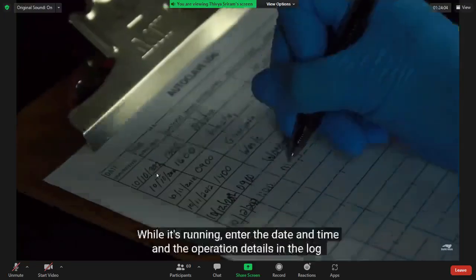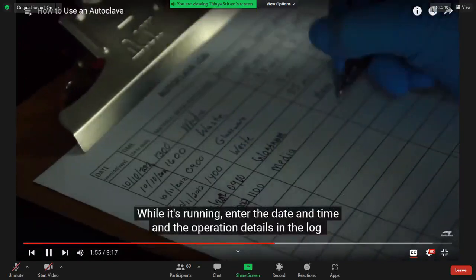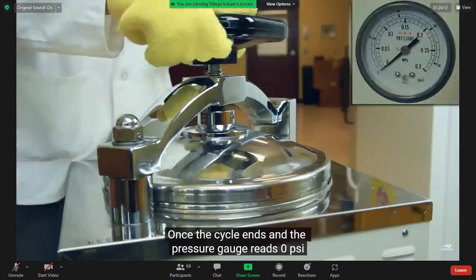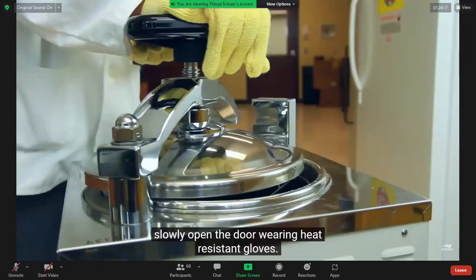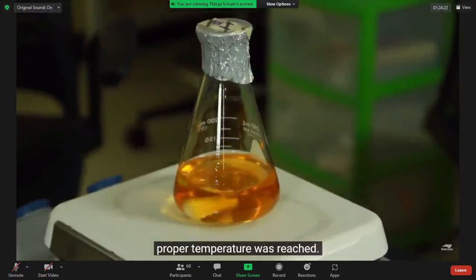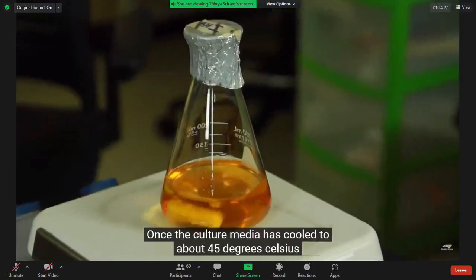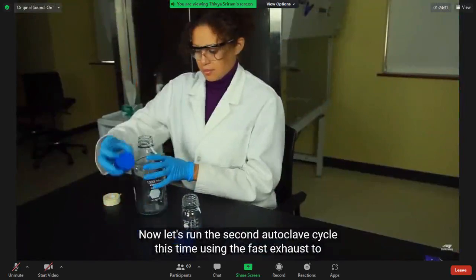Run the autoclave for at least 15 minutes. While it's running, enter the date and time and the operation details in the log and initial. Once the cycle ends and the pressure gauge reads 0 psi, slowly open the door wearing heat-resistant gloves. The black lines are visible on the autoclave tape, indicating that the proper temperature was reached. Once the culture media has cooled to about 45 degrees Celsius, it's ready to be poured into Petri dishes.